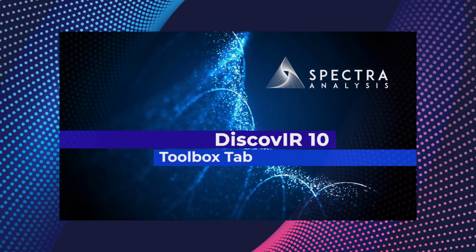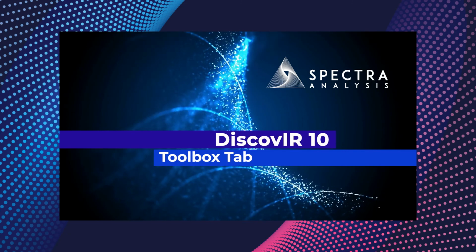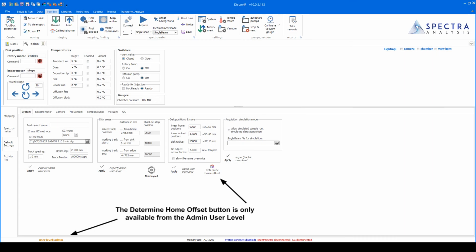For some users who are interested in LRI or matching retention time with other detectors like mass spec, it is useful to perform the Determine Home Offset procedure. This is an option for those who want to improve retention time reproducibility. More precise instructions on how to perform this are in the Toolbox tab video. But essentially, the user must go into the administrative level and go to Toolbox, Default Settings, Determine Home Offset. Running this program will automatically update the linear home position.